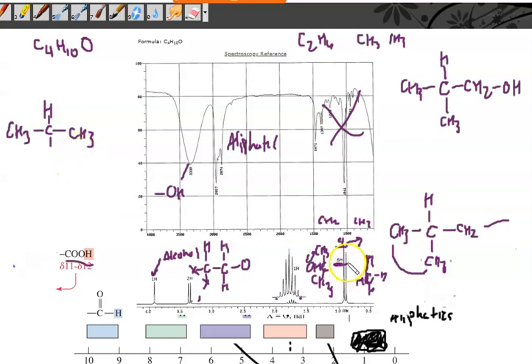So you see this a lot, a 6H doublet. If you ever see a 6H in a doublet, that means you have a hydrogen that looks like that. Once you do these so often, you'll see these types of patterns over and over again. I don't expect that to happen to you guys because you're only going to study this for another 4 days. But when you've done it 20 years, like I have, I see this and I'm like, oh, that's implying an isopropyl group, where you have a CH3 and an H. So that's kind of a trigger at this point. Okay? Make sense?